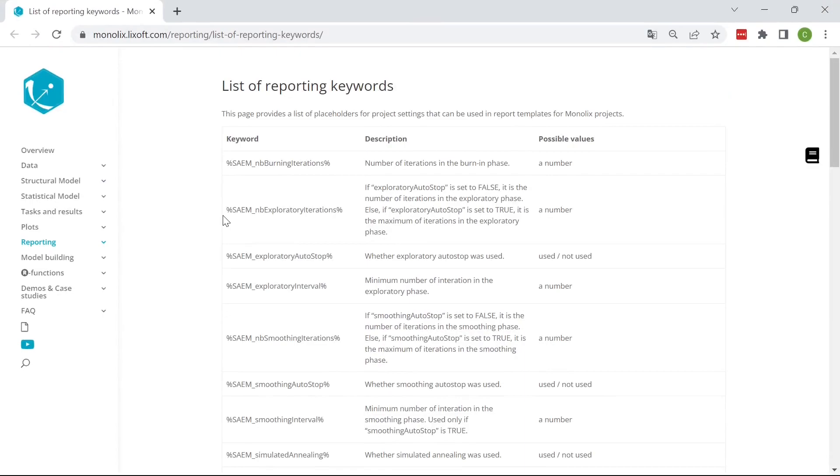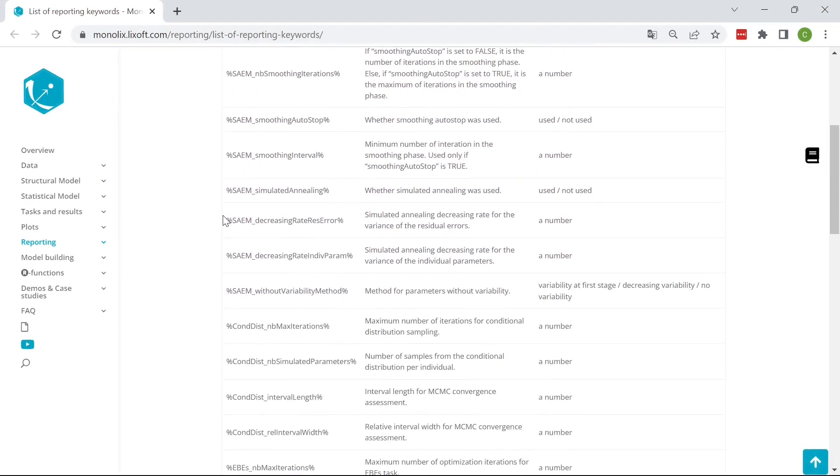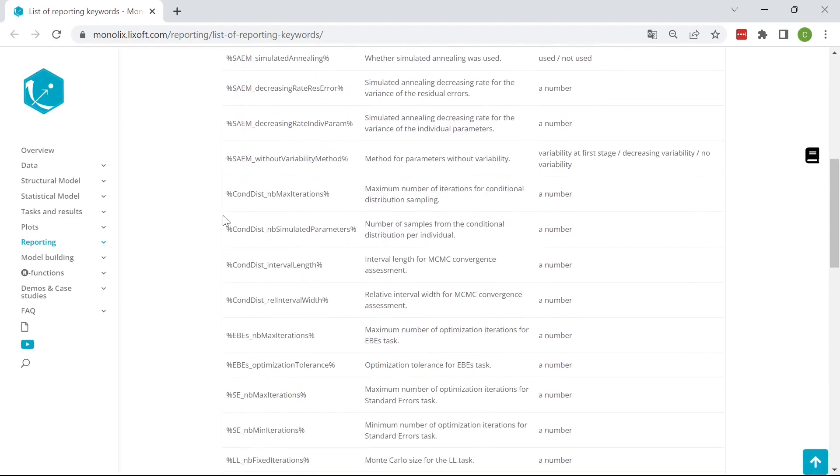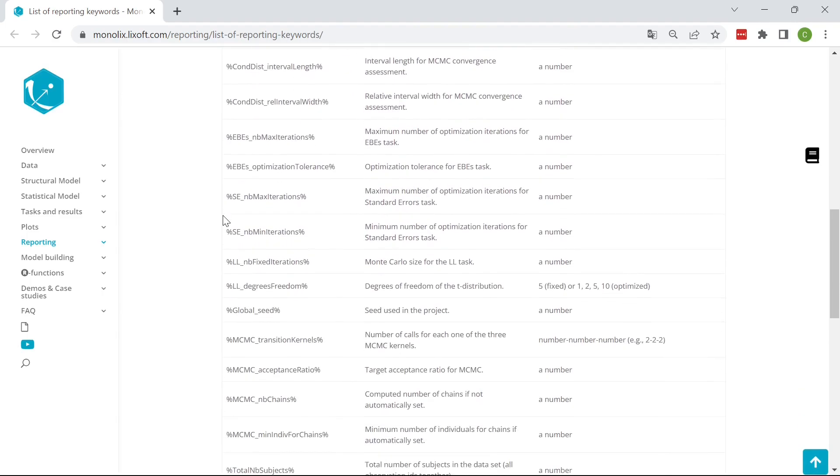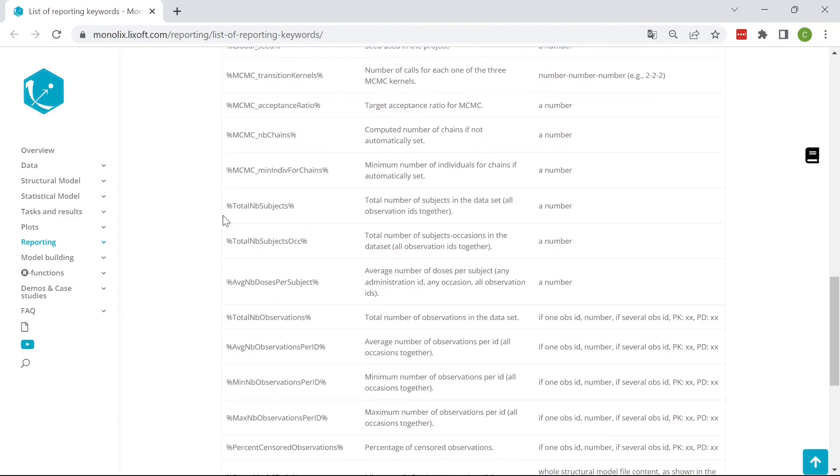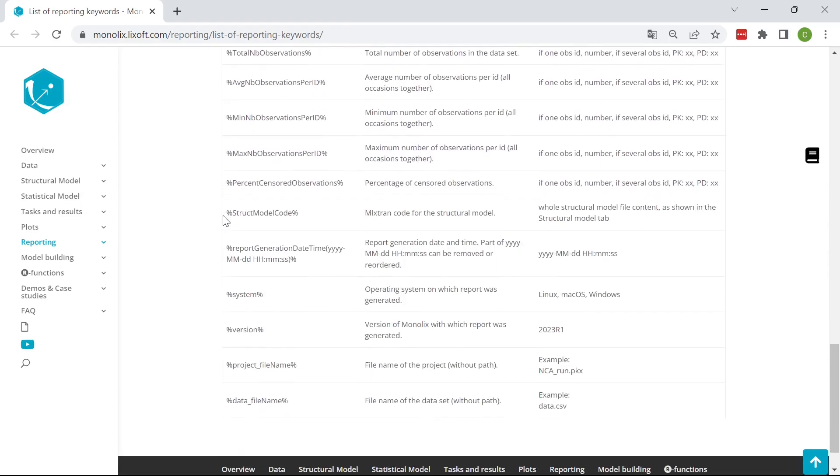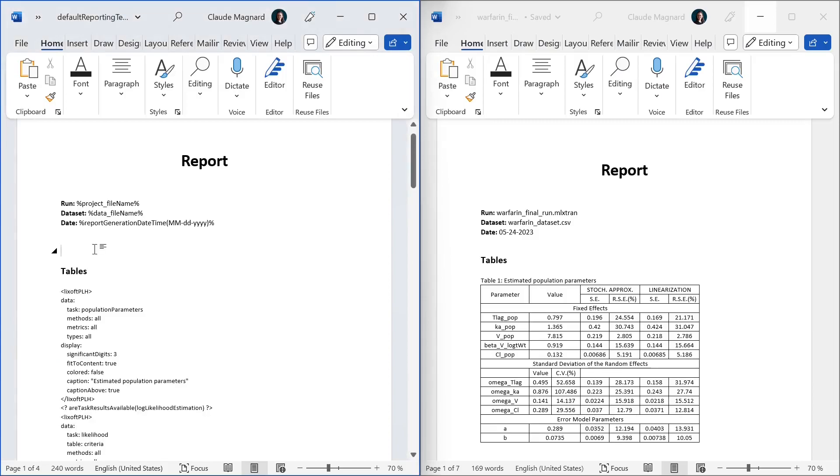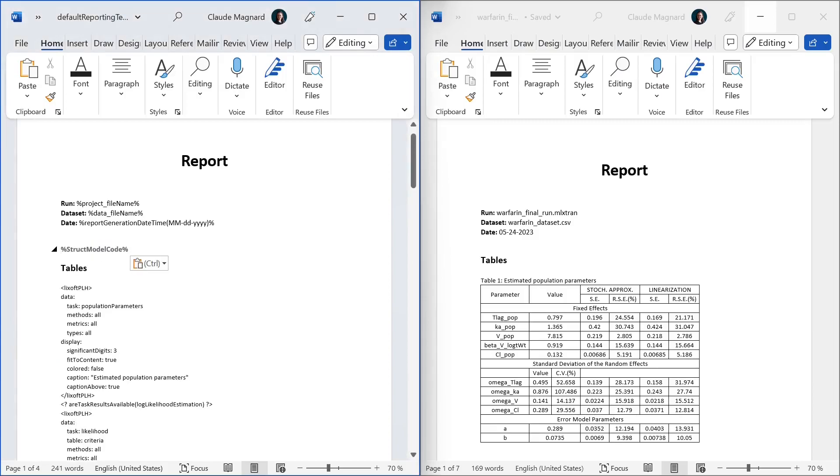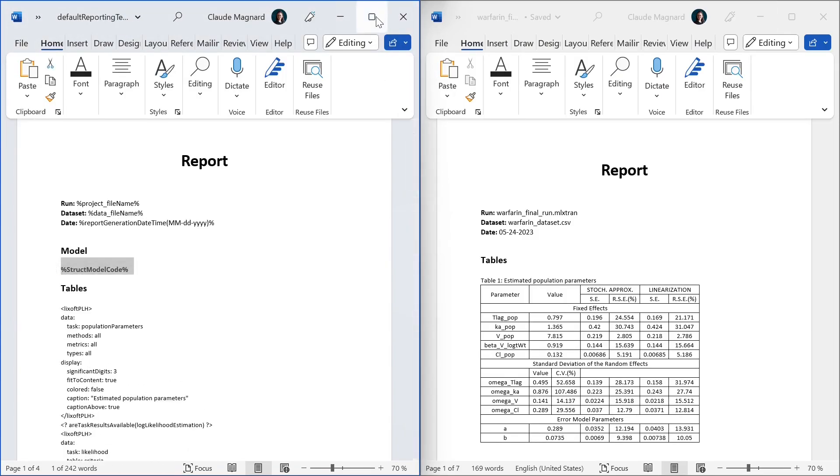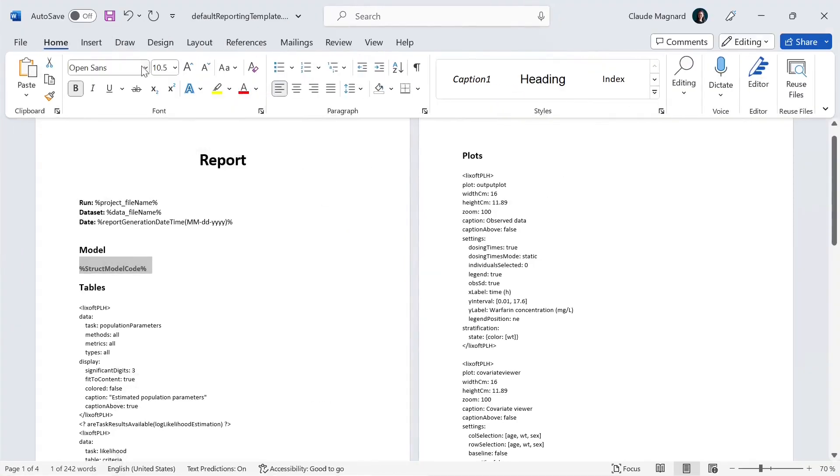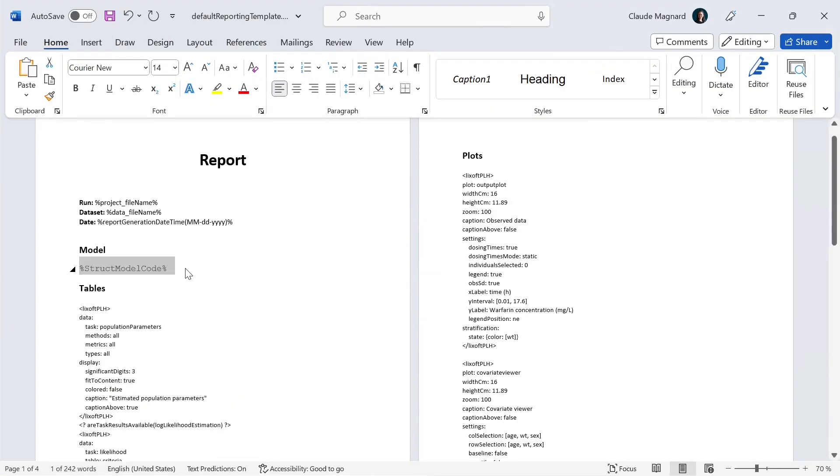Many keywords are available to report systematically the settings used to generate the results, data set related information or the code used for the structural model and so on. For example, if I take here the keyword for structural model code, I could add here a section showing the code for the structural model. I can format this keyword as I want and the formatting will be kept when Monolix replaces the keywords by its values.